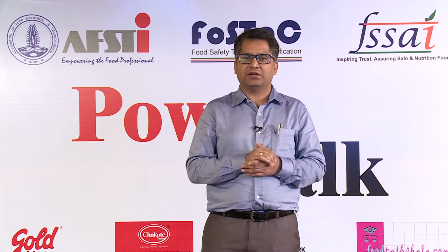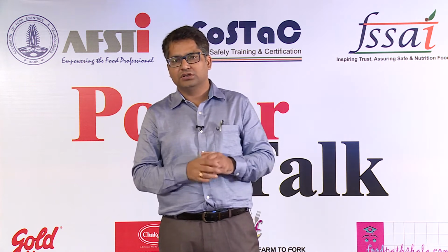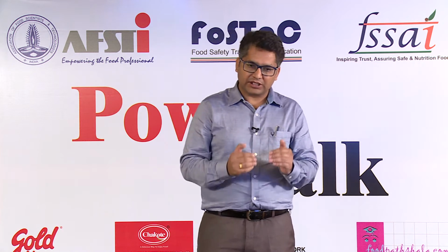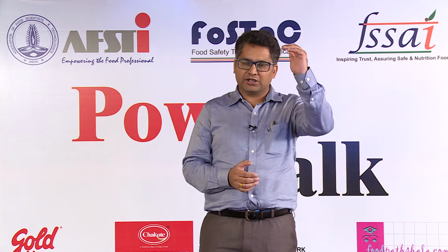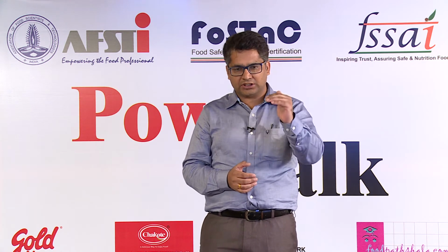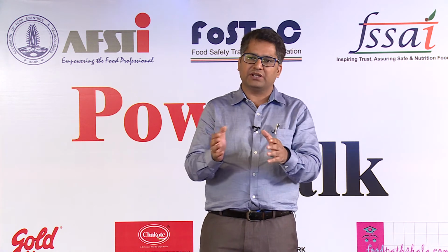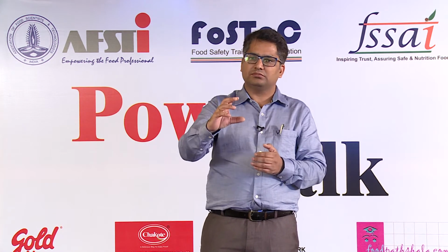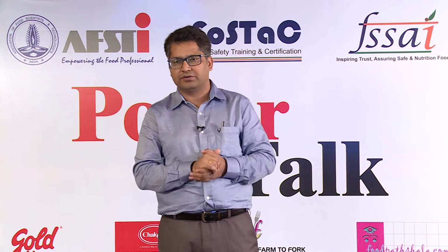Then third, the most prominent, is the digestion technique. What kind of digestion technique am I using? If I am using ashing or open vessel digestion, in both cases my recoveries go down, because even in cooking at our home, it has been proved that element levels go down 20 to 30% from the initial amount. Now if I use closed vessel microwave digestion, my recoveries will increase.